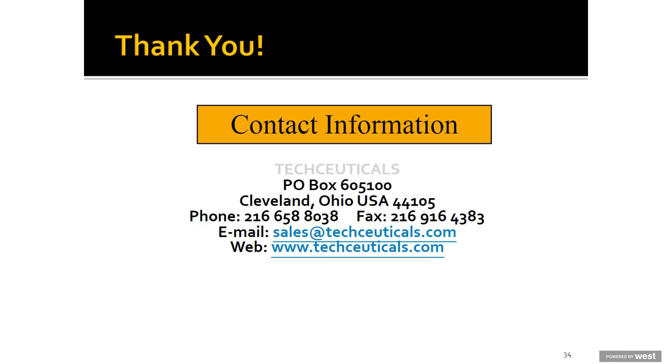Well, no, you didn't at all, because the lubricant, that is the mold release agent in the formulation, one of the most common ones is magnesium stearate, are like little platelets. The effect of the lubrication on disintegration and dissolution is profound. If we use magnesium stearate as a good example, for the most part it is not soluble in water.